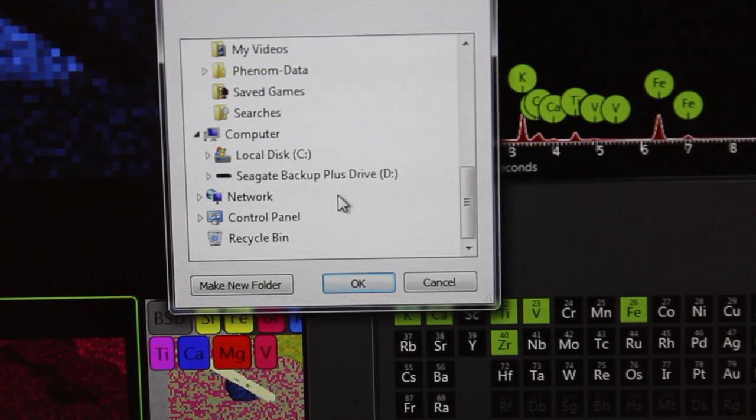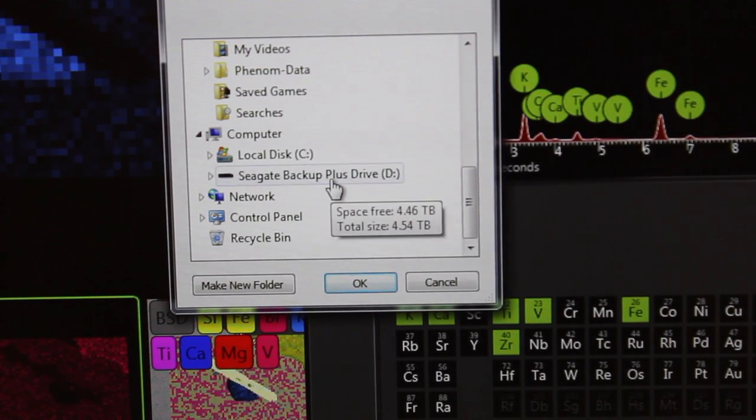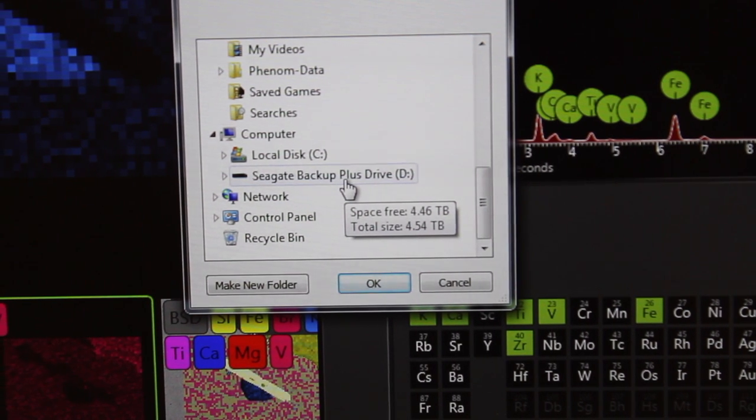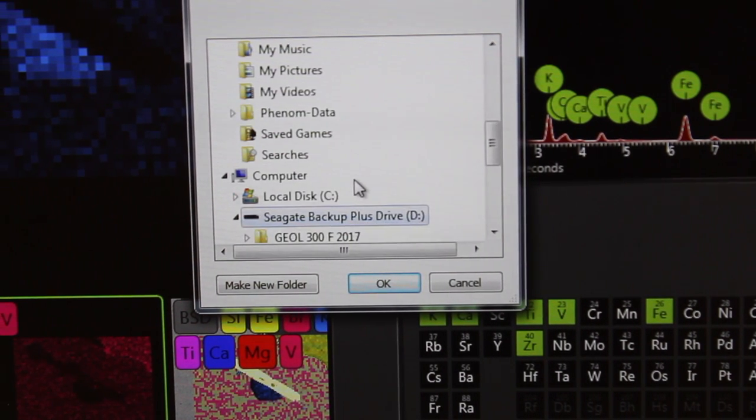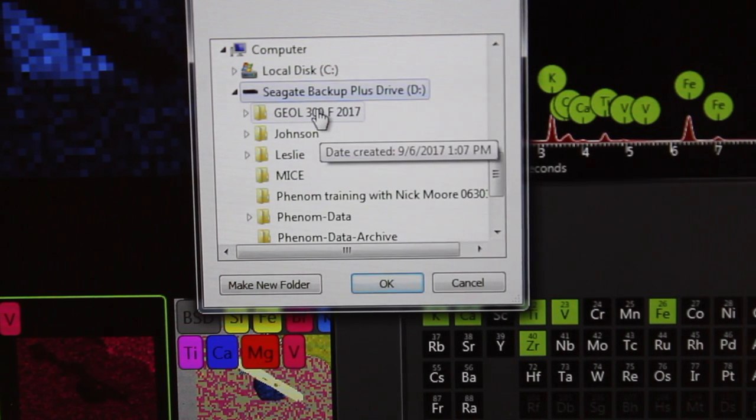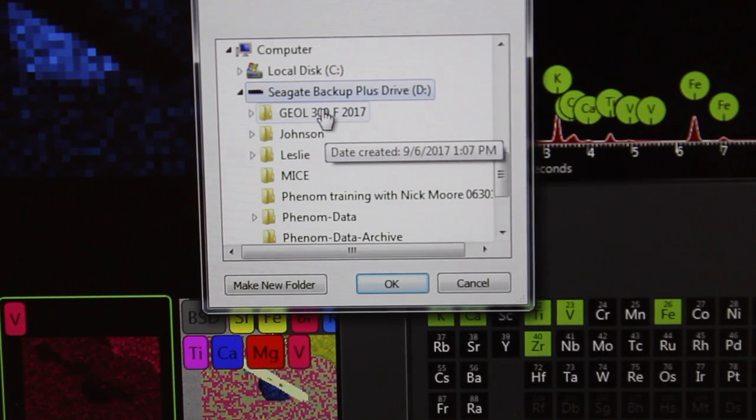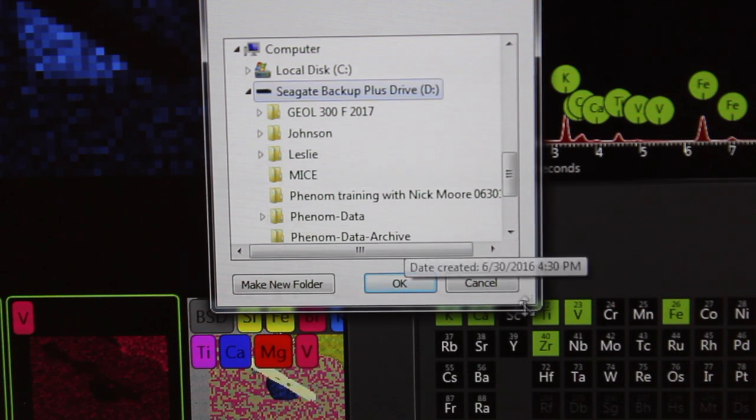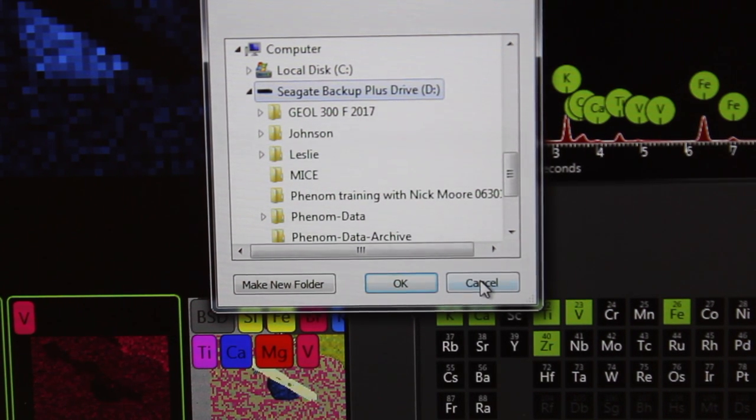In this case, we will save our data on the Seagate backup drive here, and we have folders here, and you can make your own folder and save it in there.